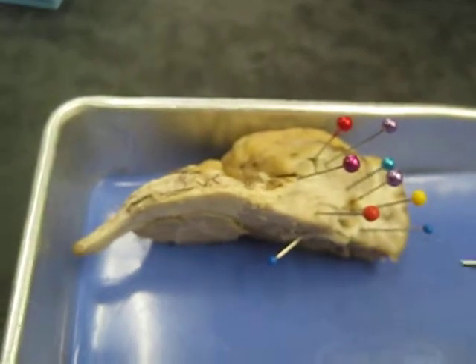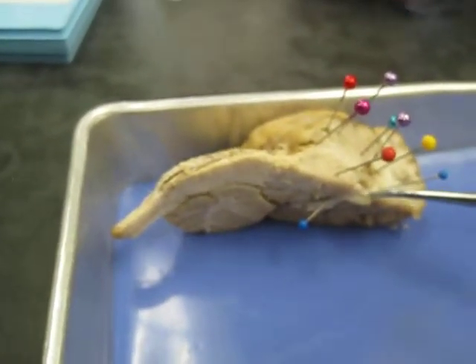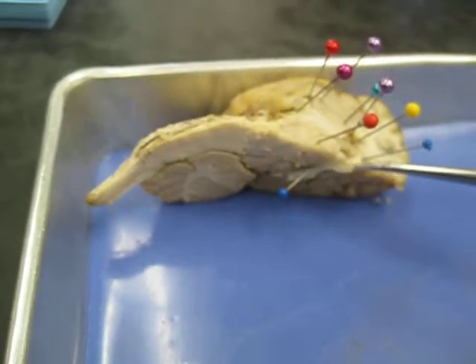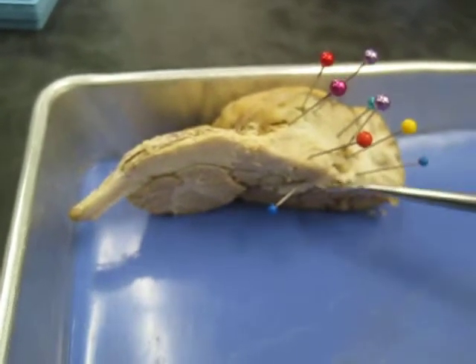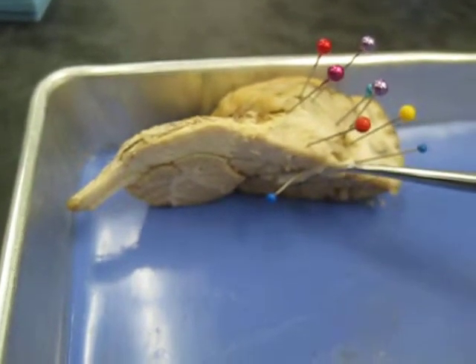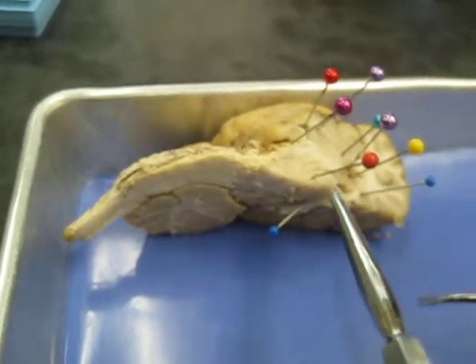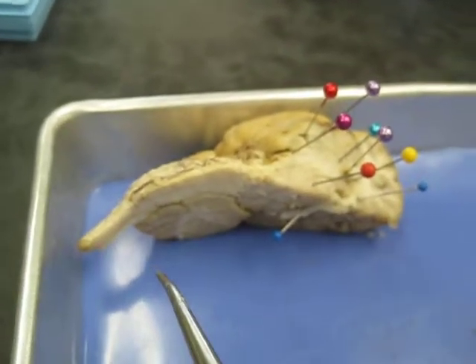So this is kind of flipped over, but what's the white stuff that's surrounding the lateral ventricle? The corpus callosum. And then the one on the bottom would be the fornix. And then if you had some white membrane stuff, that would be your septum pellucidum, right? Do you guys understand the difference between the fornix, corpus callosum, and the septum pellucidum?